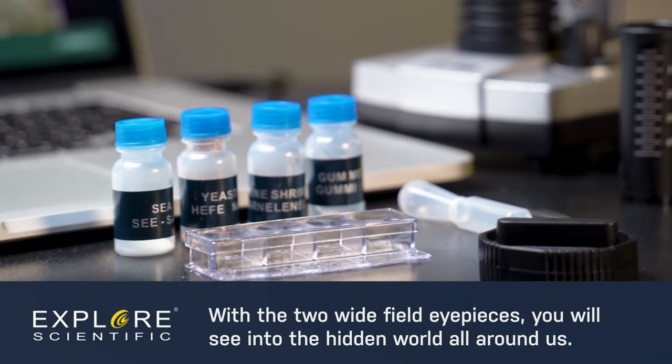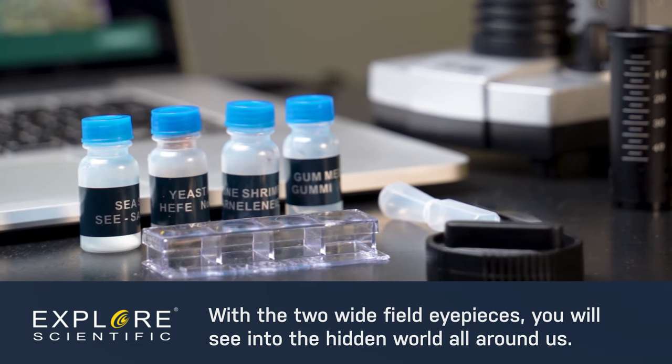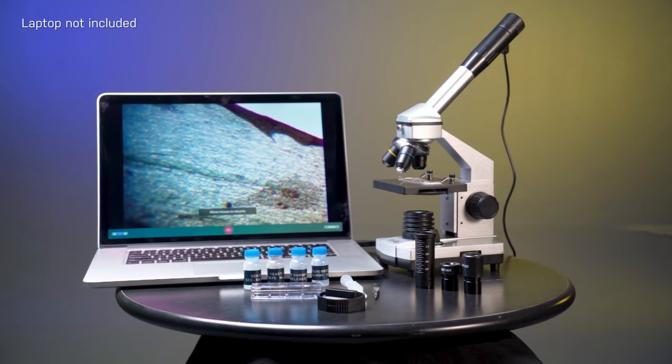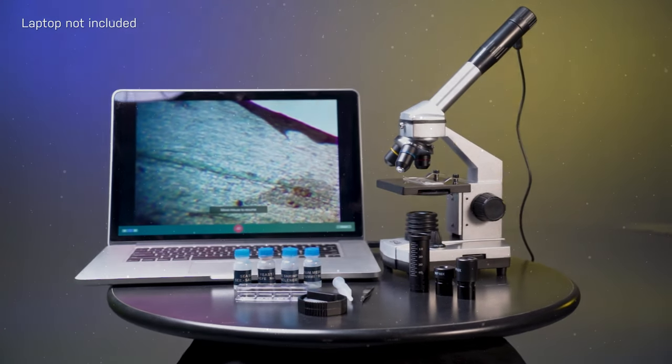With the included collection and prepping tools, a shrimp hatchery, and full accessory kit, you will see deep into the microscopic world with the Explore One 40-1024x digital microscope.